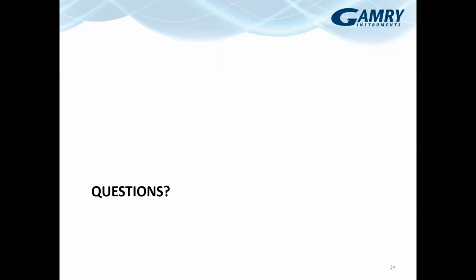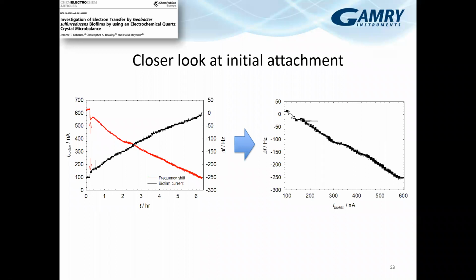All of the plots that I showed, a good example, let me see if I can pull it up. Here, there is going to be a baseline value, and I just cut that off from this data, but I had at least 30 minutes of stable background data where I did not have any cells, so I didn't have my agent that would form the film, right?